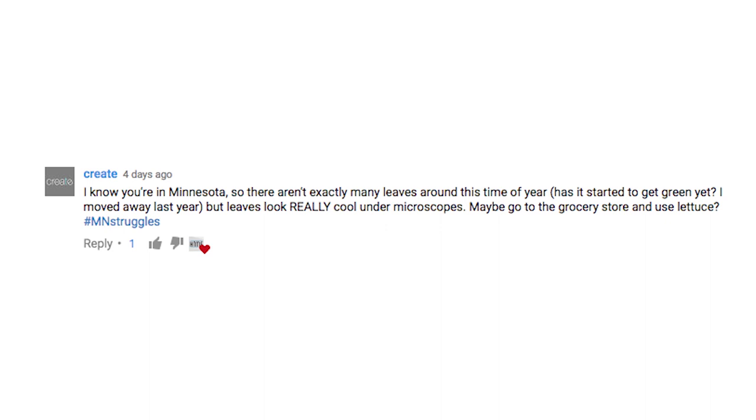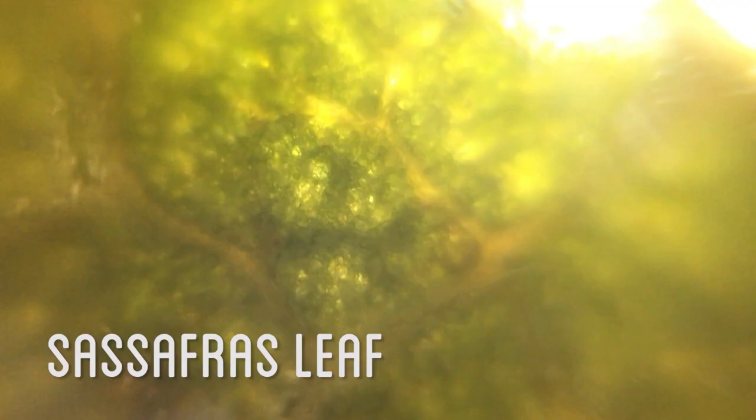Create suggested I look at leaves, so I took some leaves off of a radish plant I'm growing right now. It's pretty cool — you can actually see the individual cells. I also checked out some dried sassafras leaf I saved for my root beer.